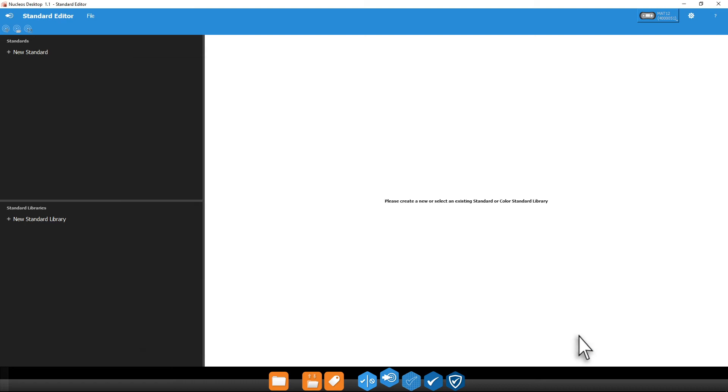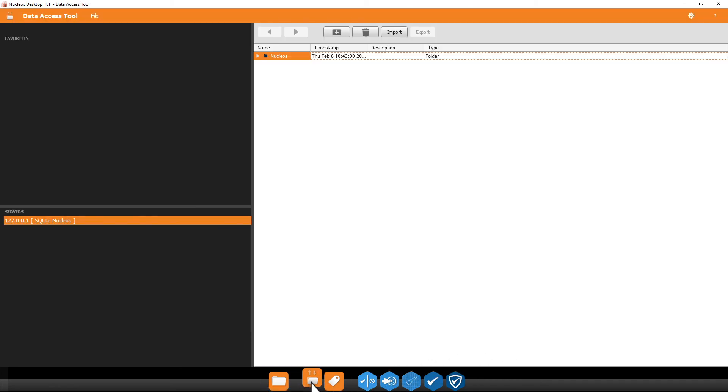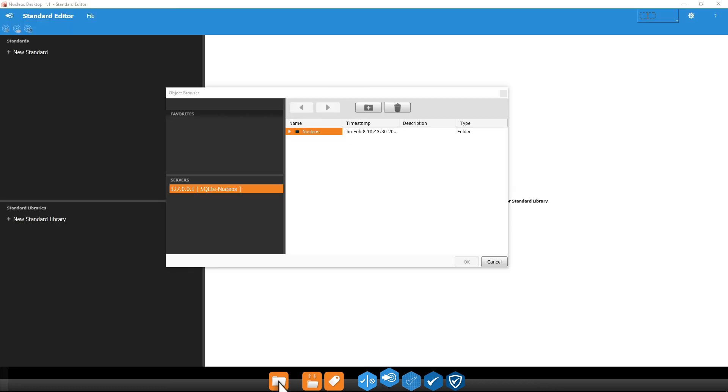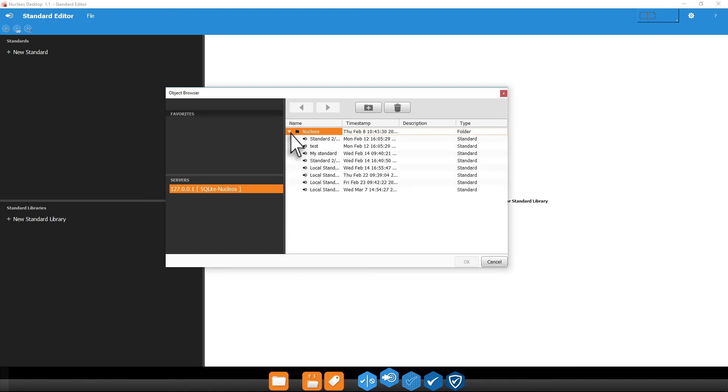Finally, let's take a second to get you familiar with the Data Access Tool and Object Browser. The Data Access Tool is an asset management system used for all of the properties, tolerances, standards, and trials you create in the other Nucleos applications. Here, you can delete and organize your data. The Object Browser is used to quickly locate and save these assets from within your other apps.